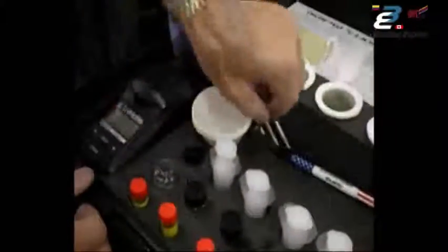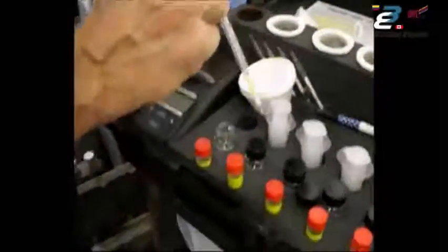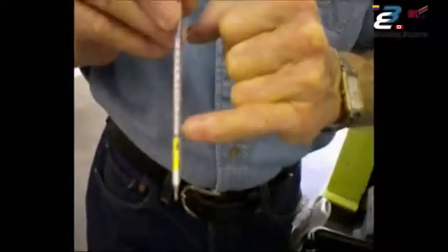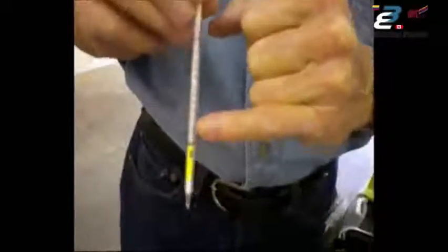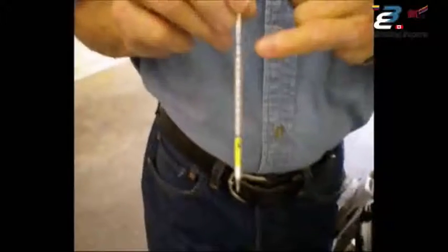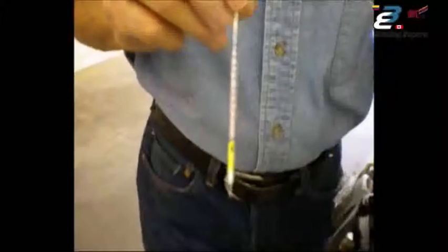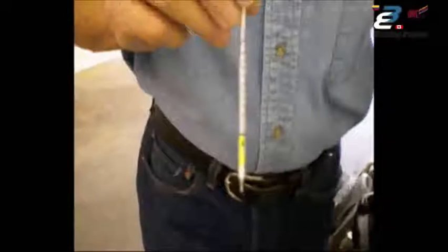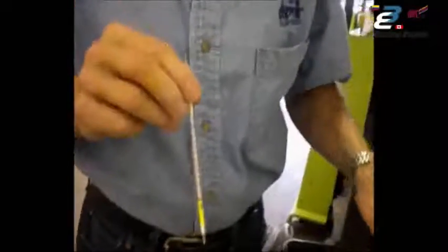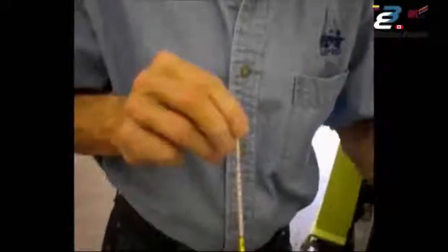To measure for chlorides, we use the titration tube. The yellow end is the bottom. The heavy blue line on the bottom is zero; the first reading is at one, and it goes all the way up to 60 parts per million. We have engineered the test kit so all readings are in parts per million, and all readings are a one-to-one ratio to micrograms per square centimeter. So if you get a reading of 10 parts per million, that is 10 micrograms.